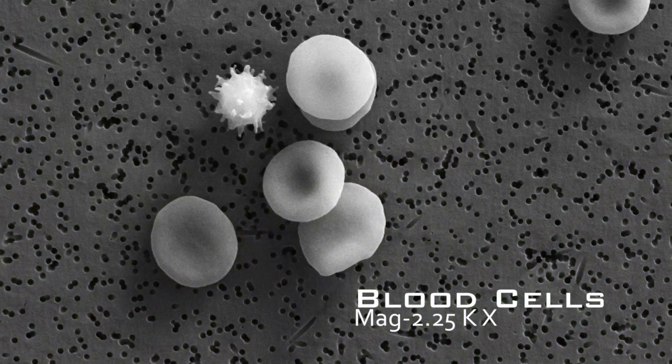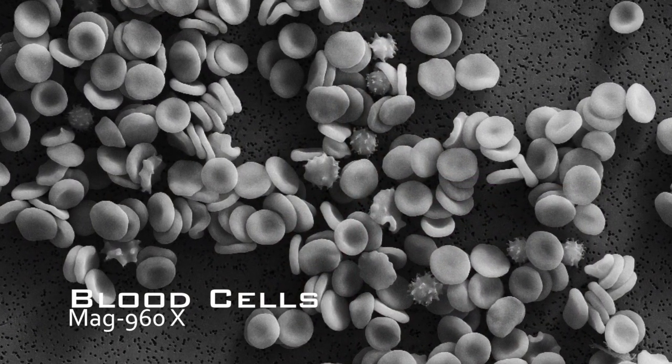An electron microscope reveals images that are a thousand times smaller. So imagine you take one single human hair and then split that hair lengthwise 20, 30, 50 times — that's how small we're talking on an electron scope.